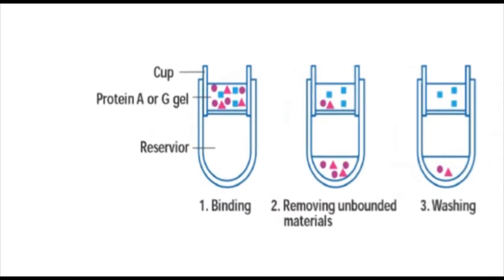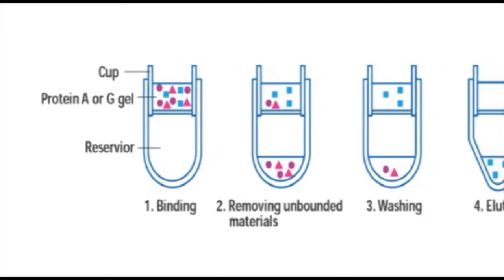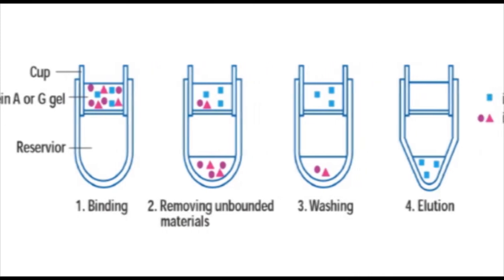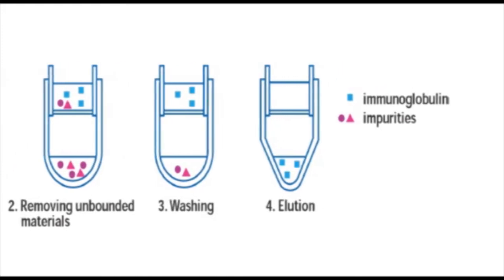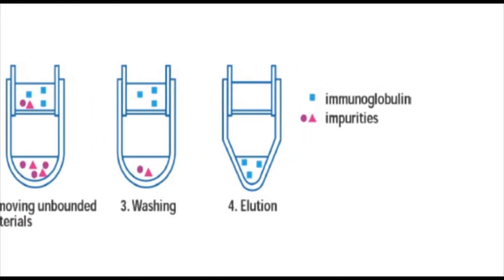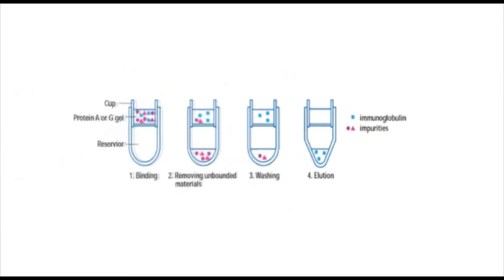Immunoglobulin samples are passed through a column containing a specific ligand. Immunoglobulins will bind to the ligand and be retained in the column. A washing step will remove all the unwanted impurities. Then an eluent buffer will dissociate the immunoglobulin from the column matrix and it is collected. Affinity purification is very specific and efficient. A single pass of samples in an affinity column will give more than 1000-fold increase in purity of immunoglobulins.